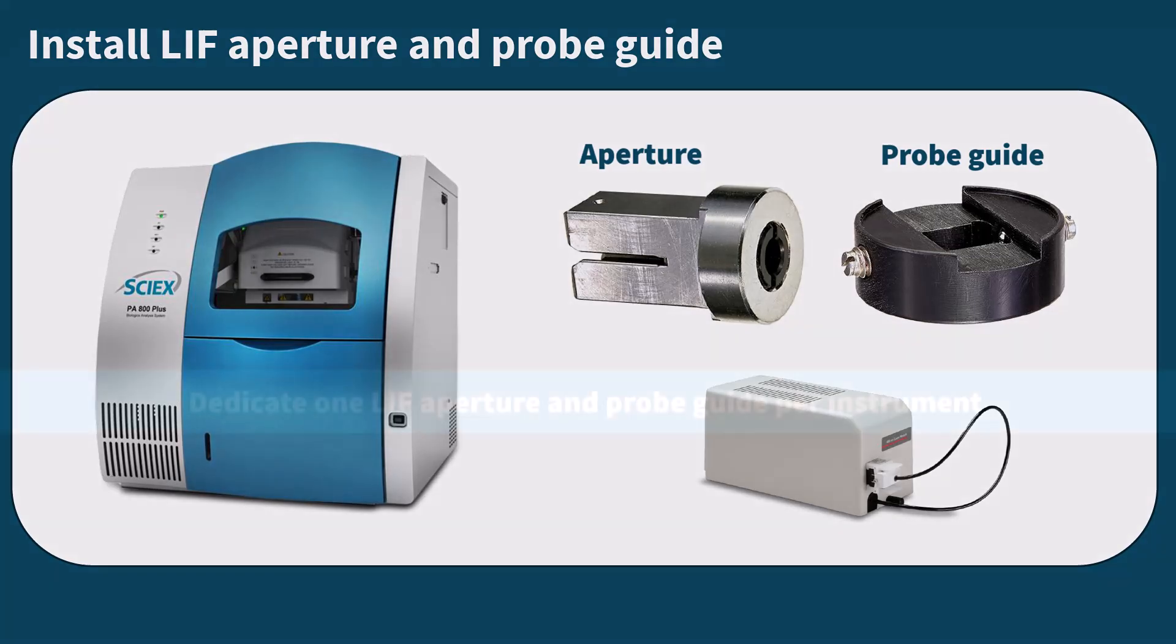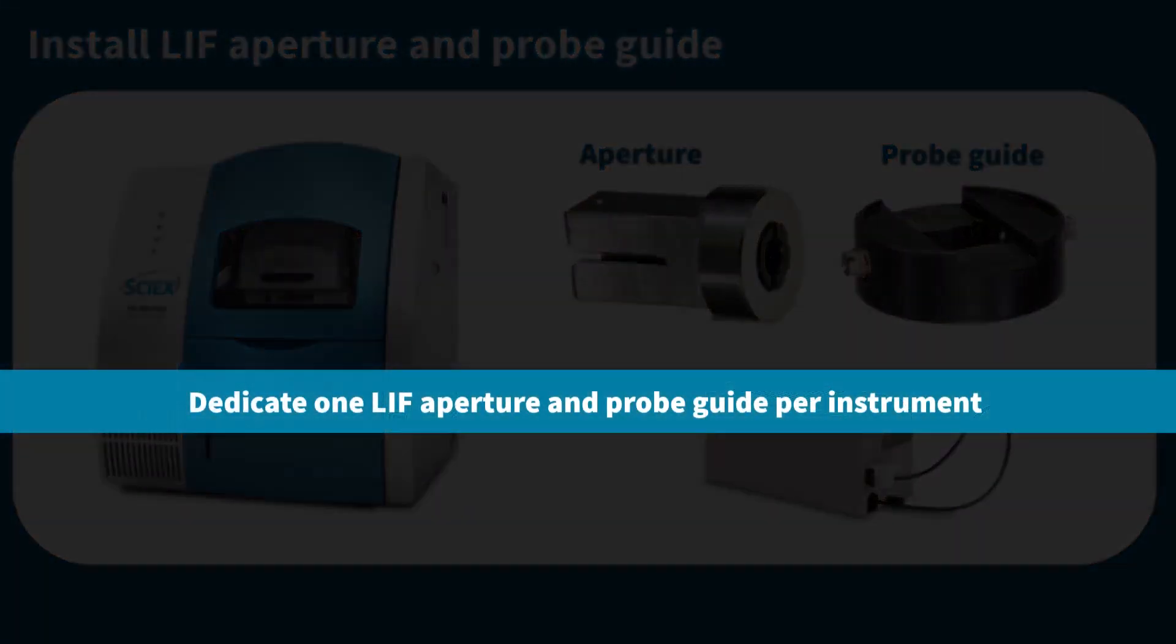It is important to have a dedicated LIF aperture and probe guide for each instrument. This helps to minimize signal variations and ensures consistent results throughout your experiments.